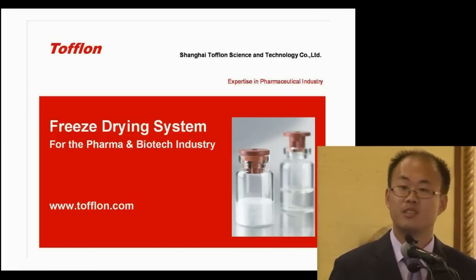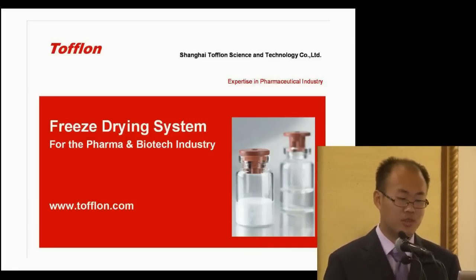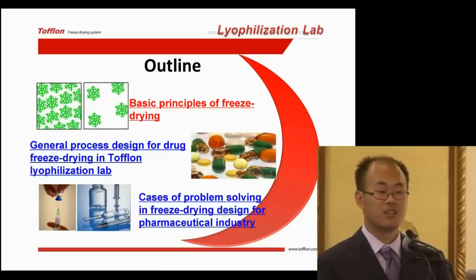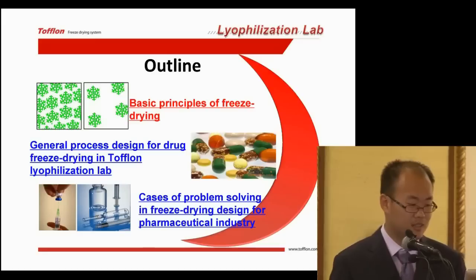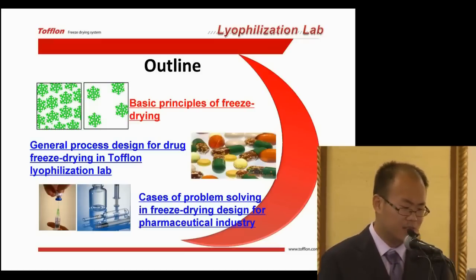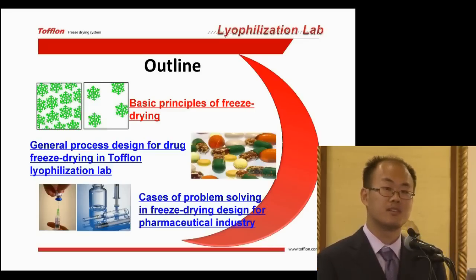Through my speech, I hope that all of you could know about the freeze drying process and design it. So today I talk about 3 parts. The first is basic principles of freeze drying. The second is general process design for drug freeze drying in Tofflon lyophilization lab. And the third is cases of problem solving in freeze drying design for pharmaceutical industry. So I list some cases.